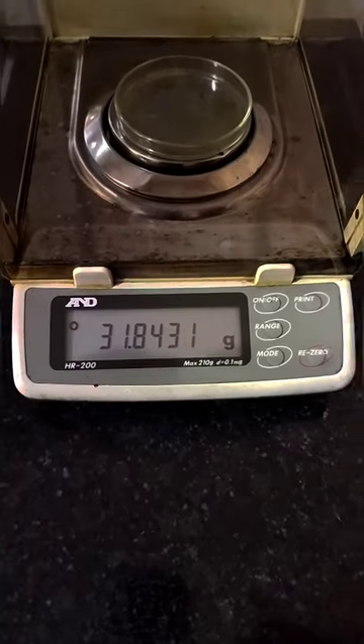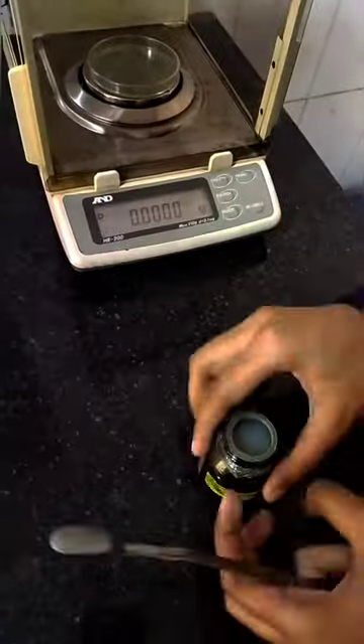First of all, take a weight balance, power it on, put a petri dish on it, and don't forget to tare it down.